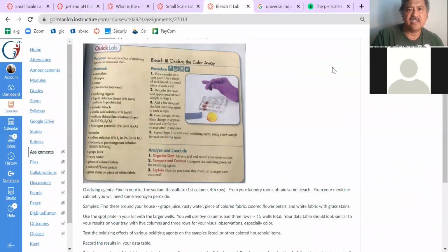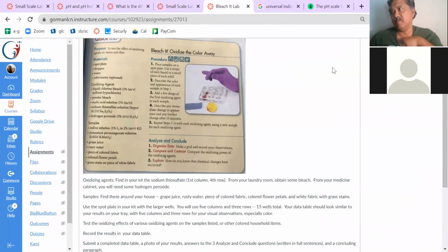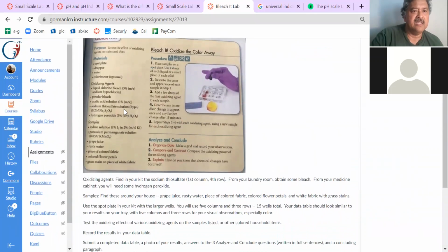All right, the last one is kind of a weird lab. When I did it last time, everything kind of just got bleached out. But it could be that you have different concentrations of stuff. For this one, if you look at the instructions, this is one called Bleach It.